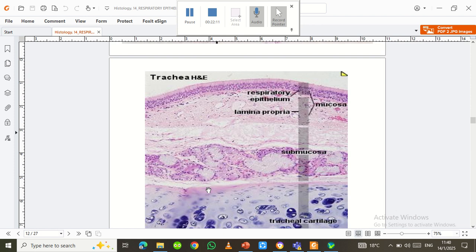That are going to take part in what you call appositional growth of the cartilage. You can actually see these lacunae, your chondrocytes, they will be inside your lacunae, right? When a lacuna has more than two nuclei, it's gonna be called an isogenous group, right?